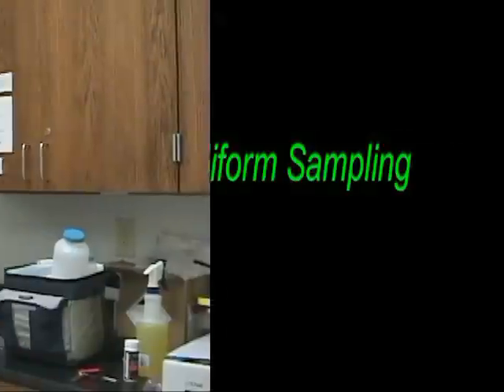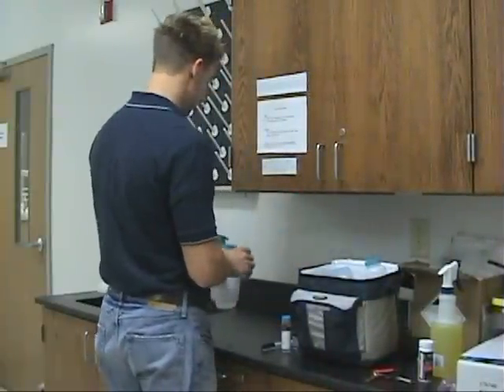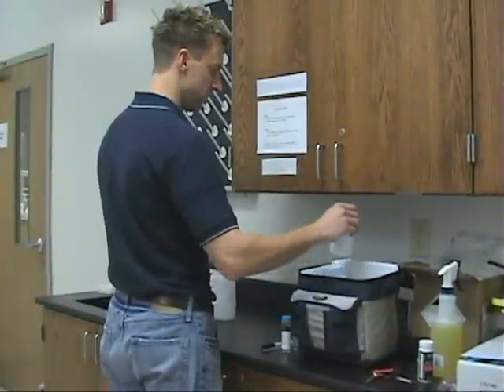This video will instruct you on how to properly collect samples for drinking water analysis. When sampling for drinking water, make sure you have all the bottles necessary for each test and that you thoroughly understand the sampling instructions.